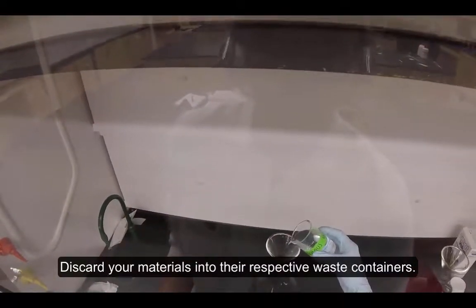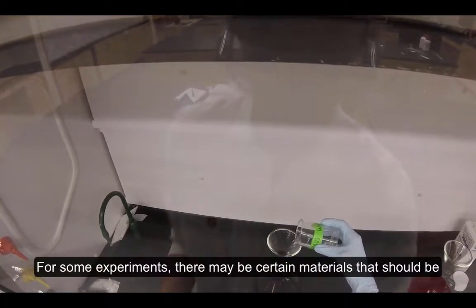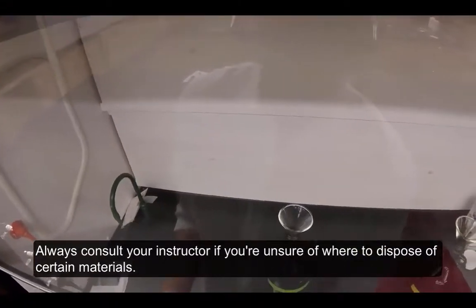Discard your materials into their respective waste containers. For some experiments, there may be certain materials that should be disposed of separately from other materials. Always consult your instructor if you're unsure of where to dispose of certain materials.